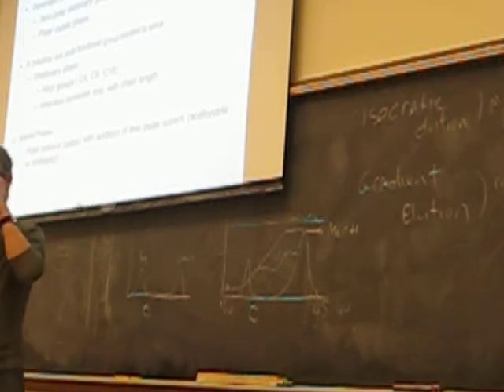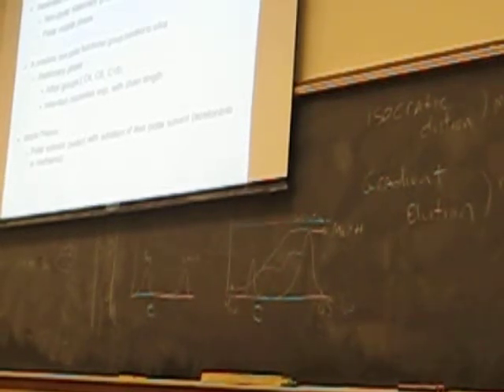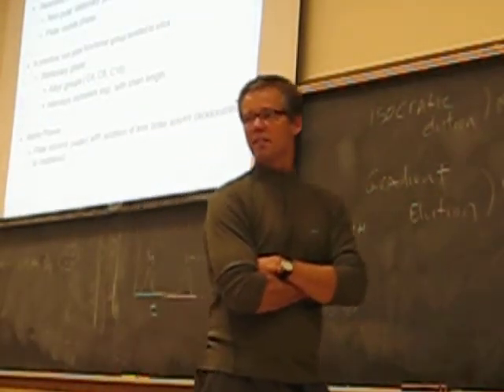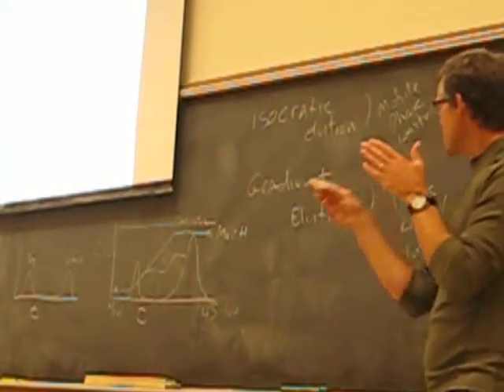Well, to reduce that time, can you just change the flow rate of the column? Can you? I'm asking the general question rhetorically. Because in that logic, you say, I'm just going to turn it to 5 mils a minute, and I'll be out here in 10 minutes. And it's not a bad idea. But the problem is that when you change the flow rate, as you'll find this coming week, the separation changes.